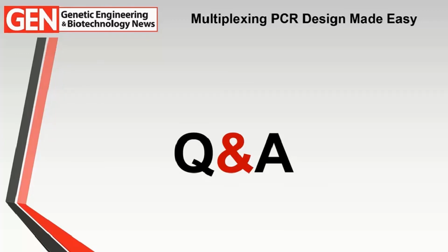Yeah, this is sort of my assertion. I would say yes. The reason is you have to have a level of sophistication in your primer design, and also have a team that is receptive to it, because at points it's very complex and computationally intensive. On the concierge mode, anybody can do it. You can work with DNA software, and they will design and give you the assay, and probably they know more than you even think. But if you want to develop a custom method in-house, you just have to have the right bioinformatic tools and expertise and be receptive to it.